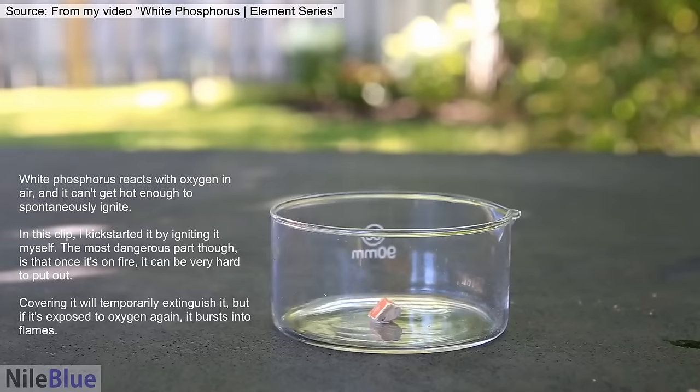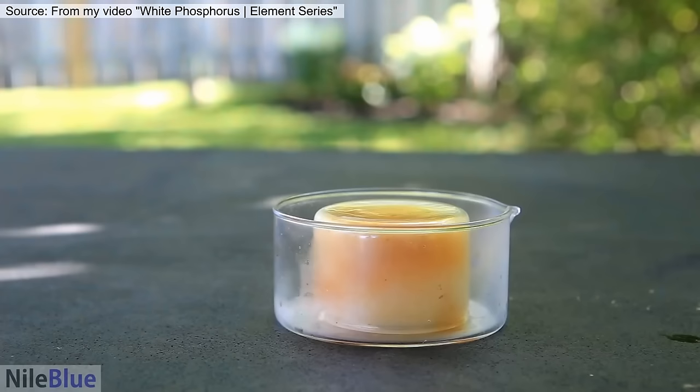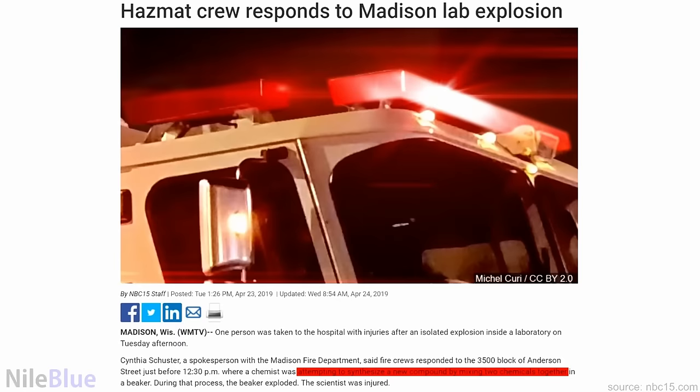So, it's not that you can never combine these chemicals ever, it's that you just have to know what you're doing and be prepared to handle the reaction that will happen. It's only when it's accidental and you don't expect it that it starts becoming dangerous. It's also really not uncommon to hear about lab accidents that were caused by mixing incompatible chemicals.